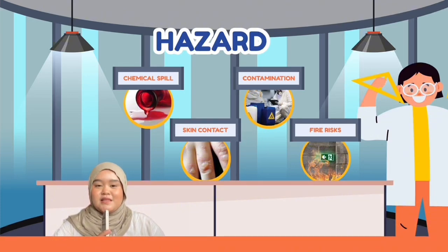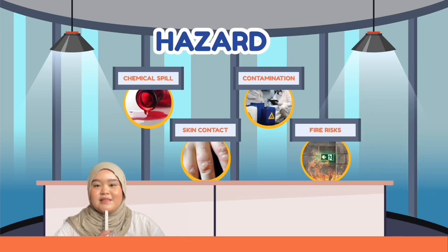Good OSH practices require all lab users to clean their work areas after experiments, store chemicals properly, and keep benches organized. A clean lab is one of the simplest ways to reduce risk.